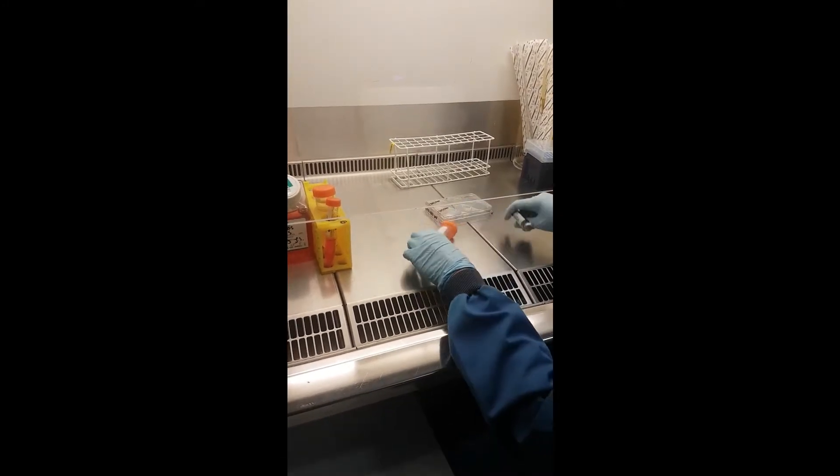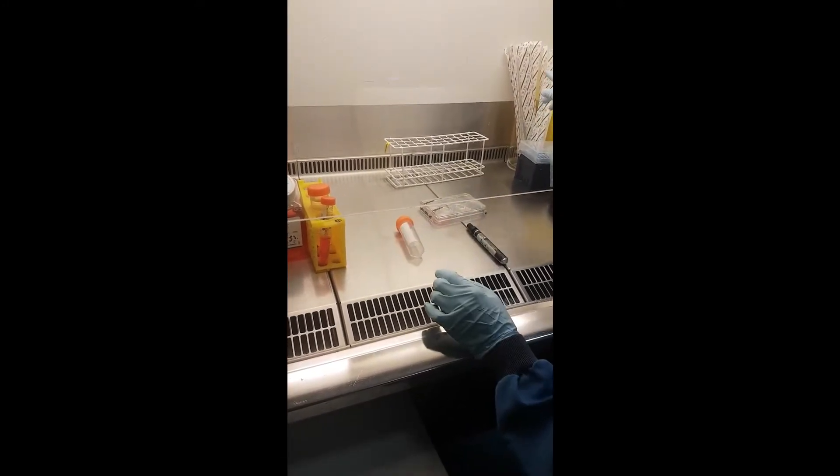Before starting, check if there are enough harpy dips here and in the drawers. If that's all good, you're ready to proceed.